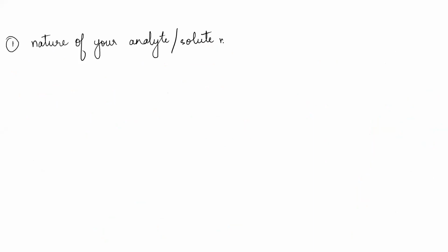choosing of stationary phase is also important. Now what does your choice of stationary phase depend upon? It depends upon the nature of your analyte, or you can also call it as solute. Okay, mixture, because whatever mixture you are loading, it can be a mixture of enzymes, it can be a mixture of enzyme plus amino acids, drugs plus nucleic acid, whatever mixture you are loading, it can be of various things. So whatever you load on the stationary phase will depend on your solute mixture.